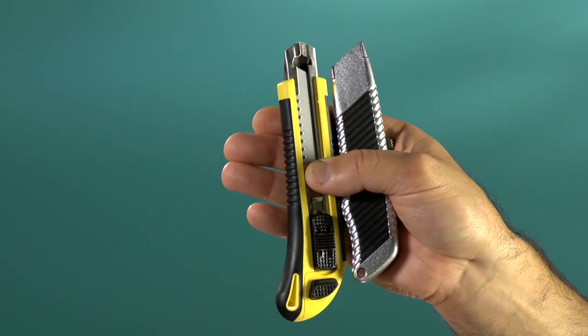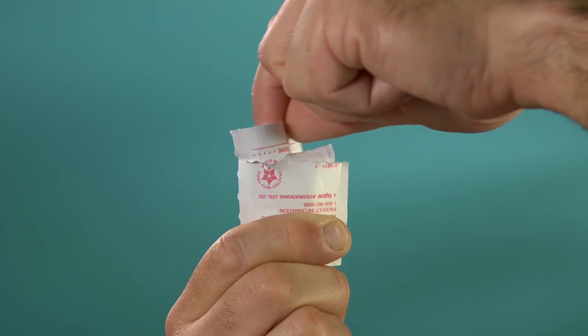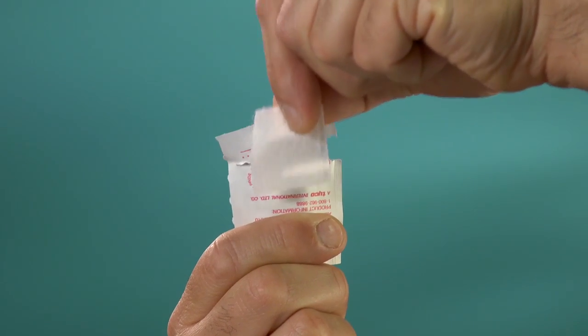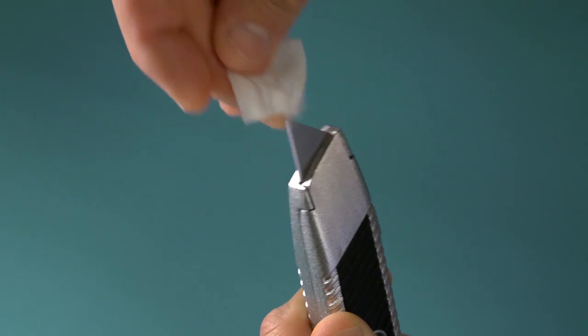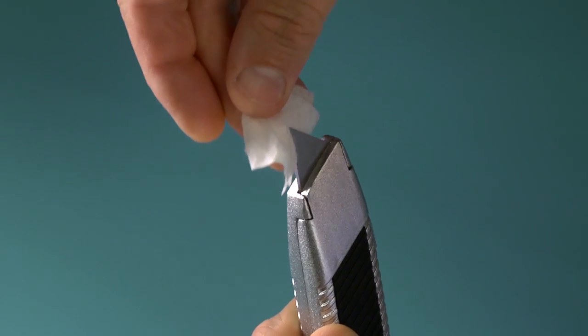You will also need a sharp utility knife. You should also have some alcohol wipes on hand to clean the blade of the knife before and after testing each area. This is done to prevent cross contamination.